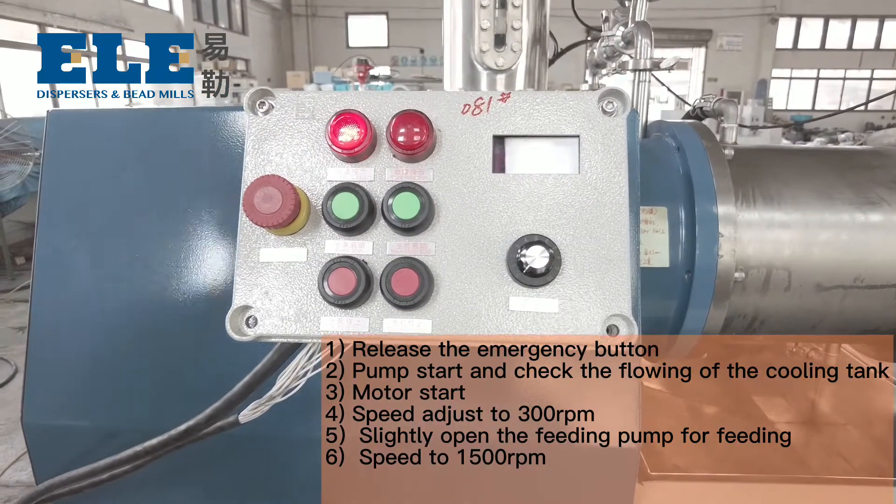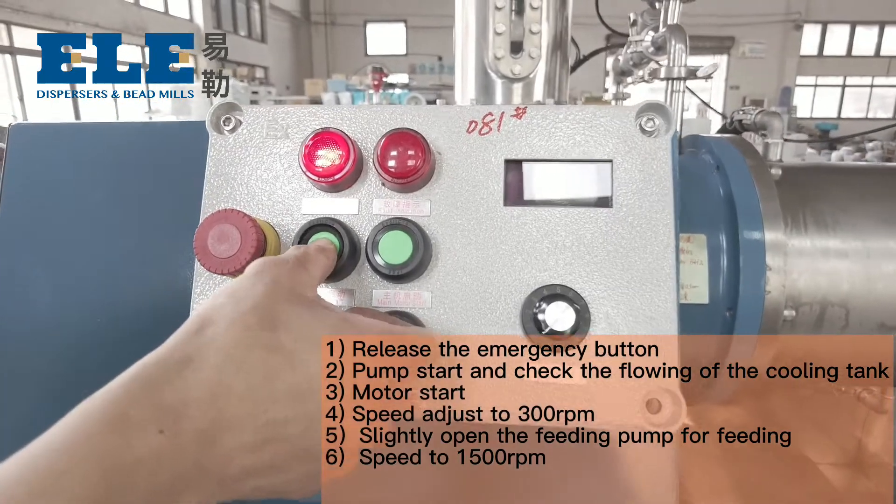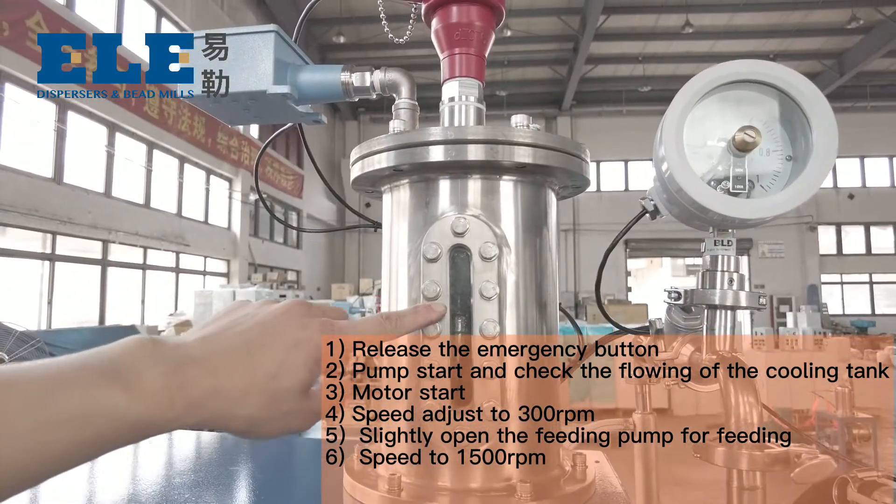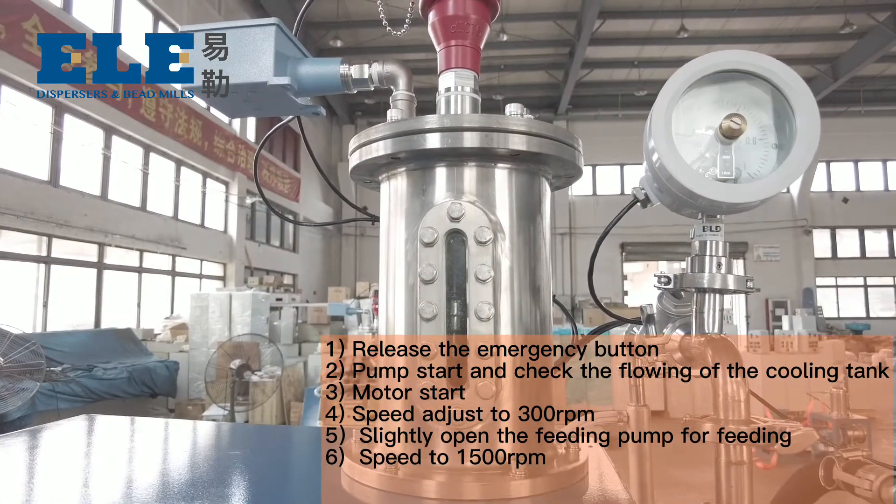Start the machine. Release the emergency button. Pump start, and check the flow of the cooling tank — make sure it is flowing.